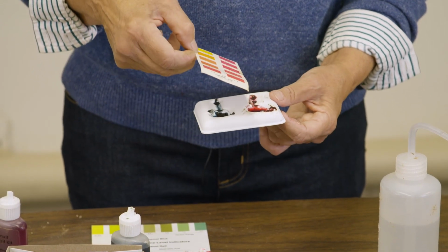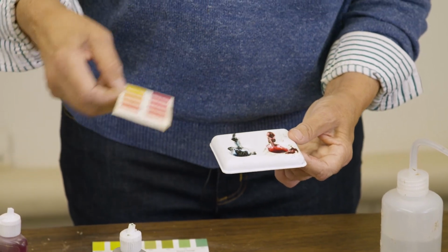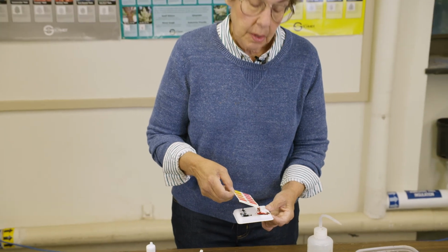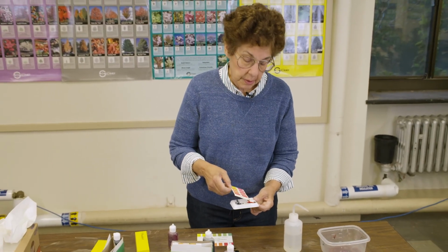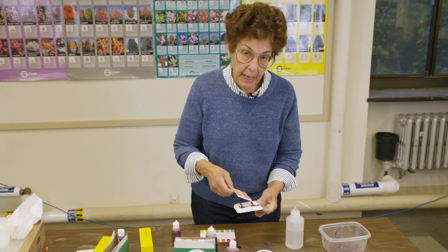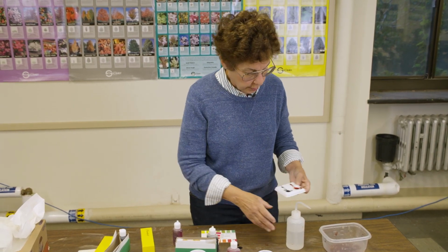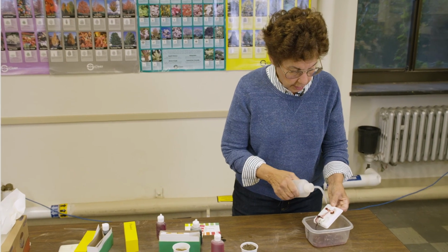So we have much more alkaline soil here than we did in the first sample. And that's going to determine which plants can grow well in some of those types of soils. So we need to know that for plant selection. And it's a very simple test that you can do without any special equipment.